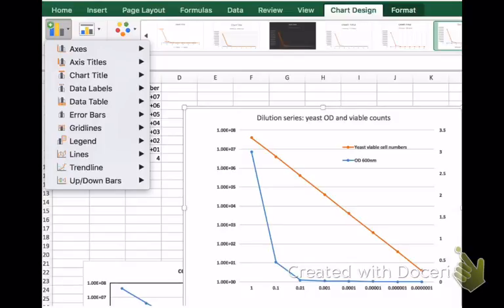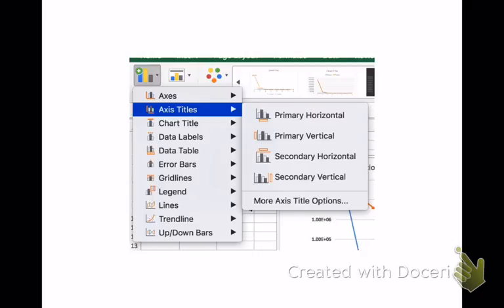Now you'll notice that here's my graph and it's up to date. We've labeled series as OD 600 nanometers or yeast viable cell numbers. And we have all of our axes are properly numbered, but they aren't labeled. So now we're going to go back to chart design. Notice up here, chart design option. And over here in our chart, we have many options for legend, trendline, data labels, which you may or may want to use. But we're going to work on axis titles at this point. And I'm going to work on the primary horizontal axis, primary vertical, and the secondary vertical so that anyone can look at my graph and know exactly what's represented by the numbers on each of those axes.